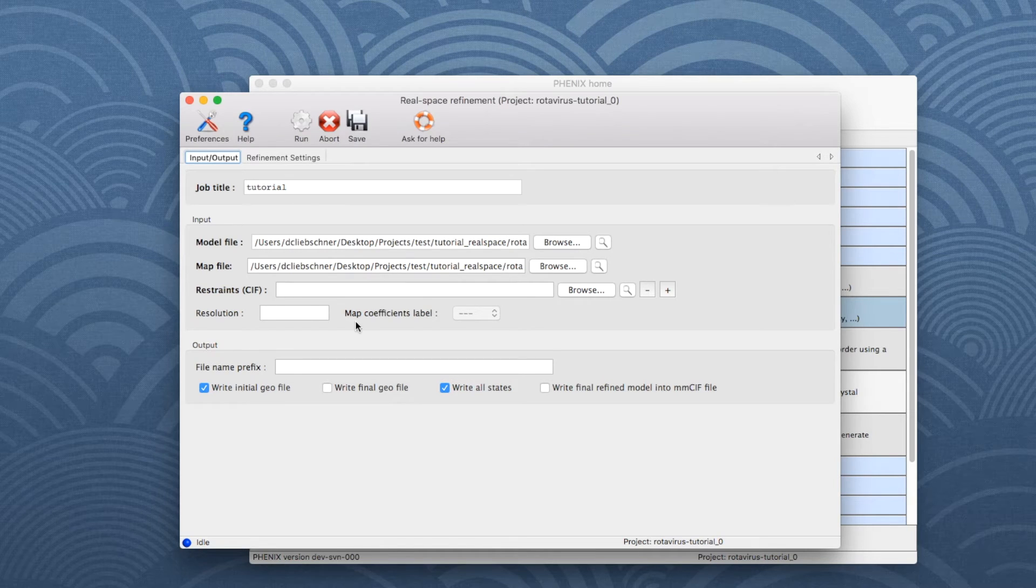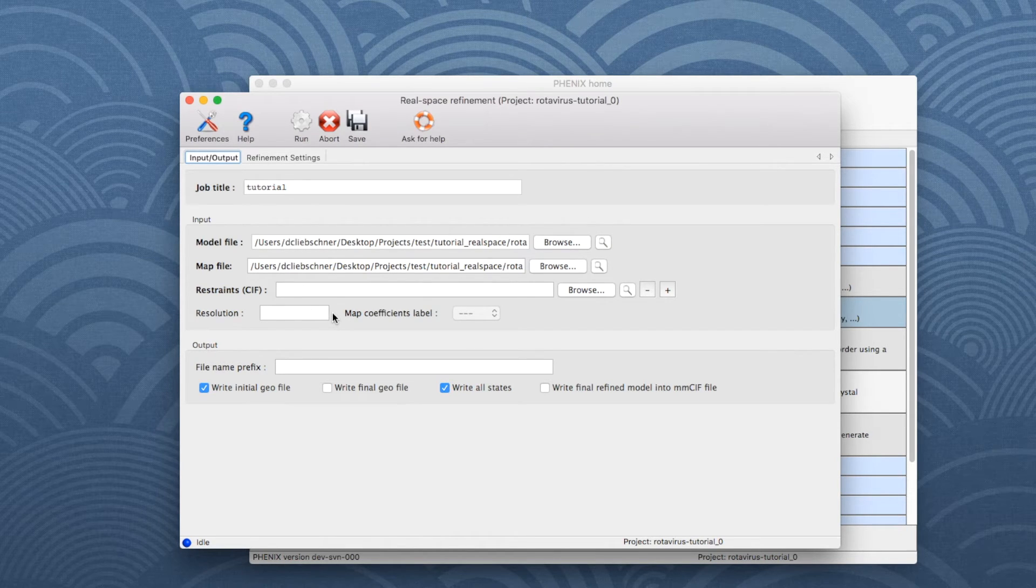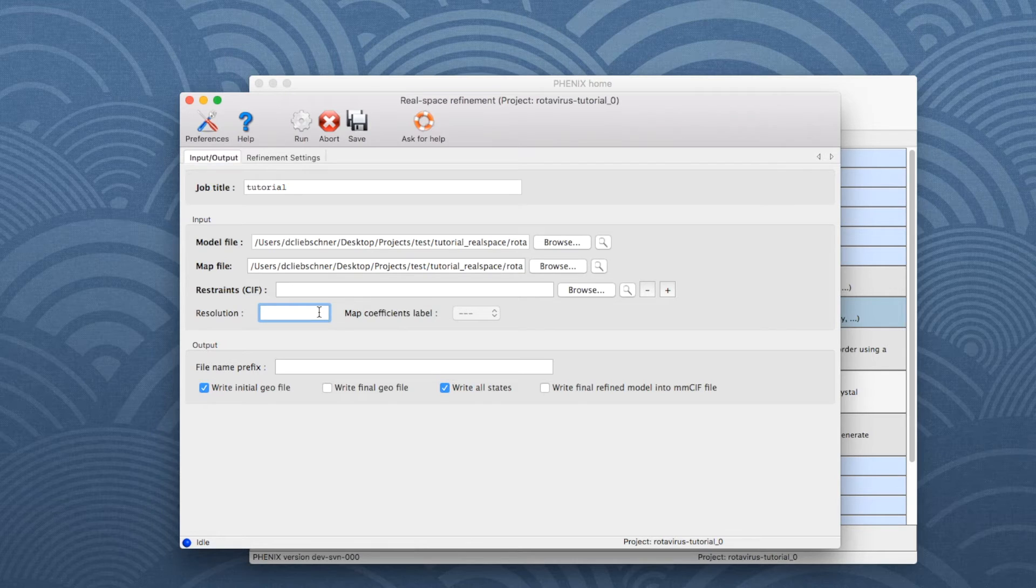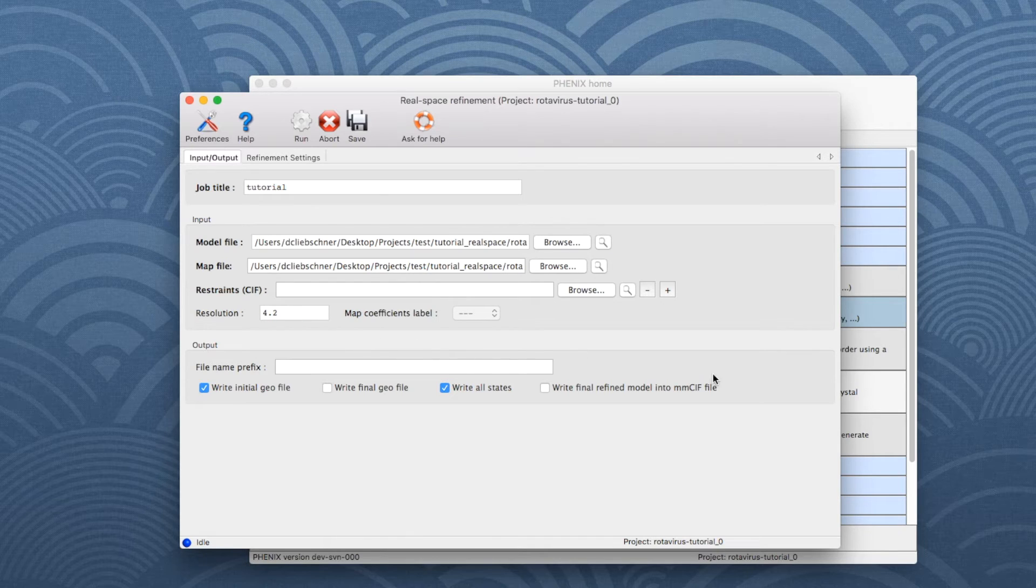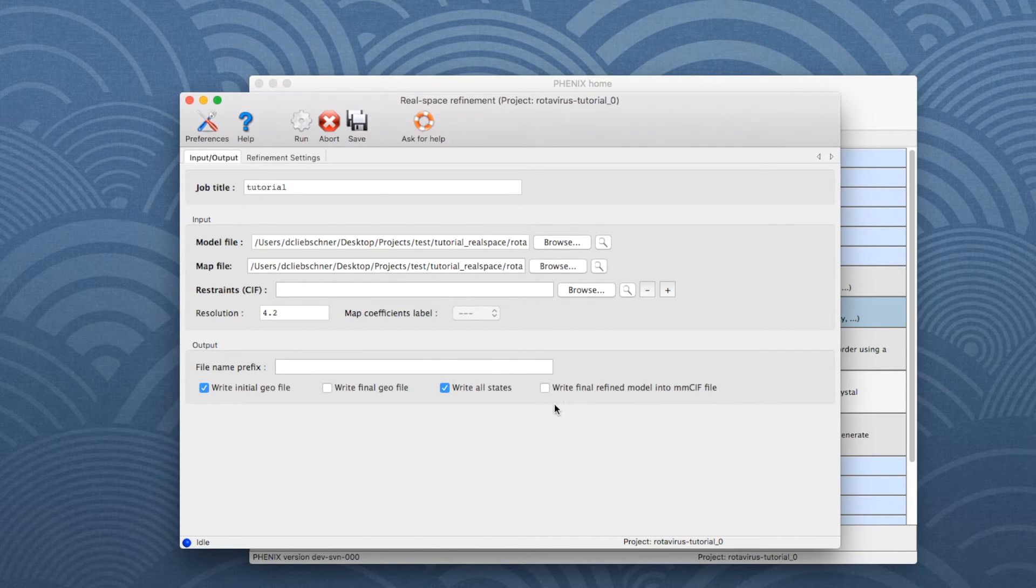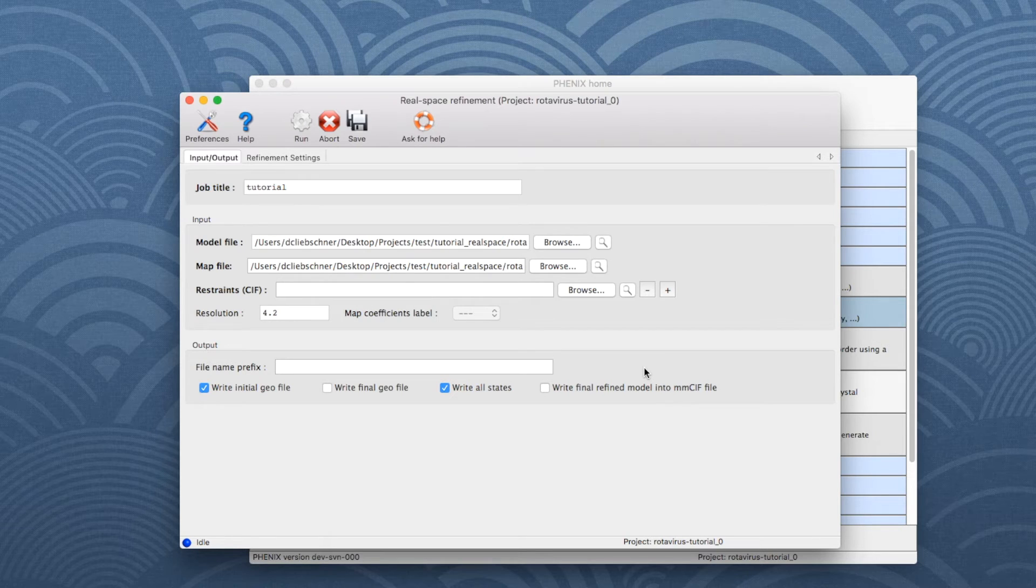As we use the CCP4-formatted map file, we have to input the resolution, which is 4.2 for this example dataset. Type 4.2 in the corresponding box. If the output model file should be written in MMCIF format, check the box in the Output section of the window.